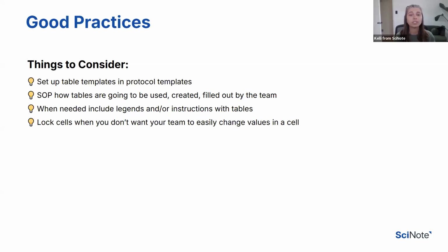When it comes to tables, if you set up your tables in your protocol templates, this will result in you capturing all of your necessary data, so everyone knows what information needs to be included when analyzing.